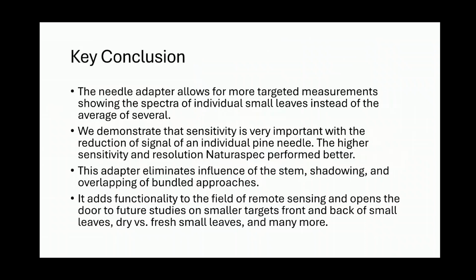So in summary, the key conclusions are that the needle adapter allows for more targeted studies, allowing us to target that individual needle instead of the average of many. We demonstrate the reflectance measurements are comparable. The quality of measurements is comparable to the bundled pine needles.